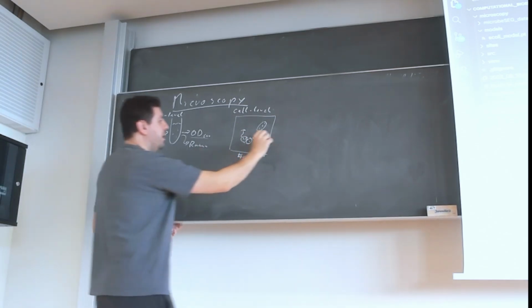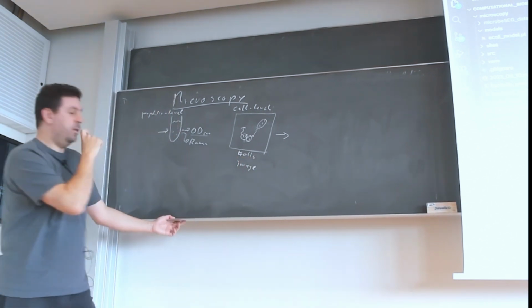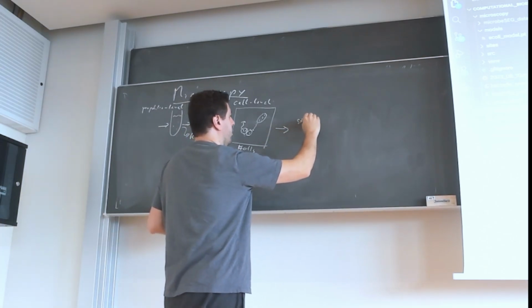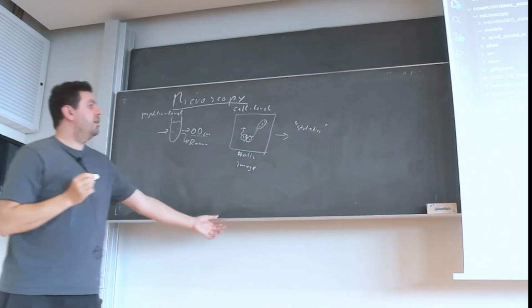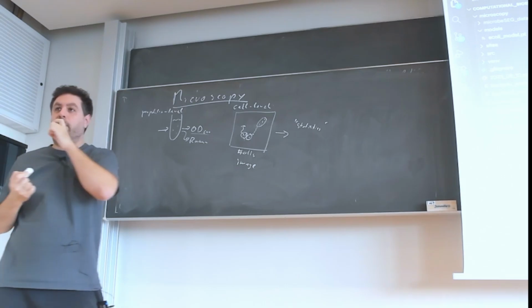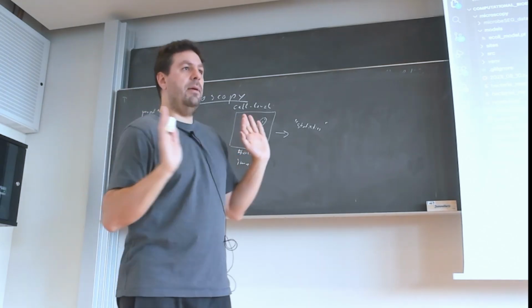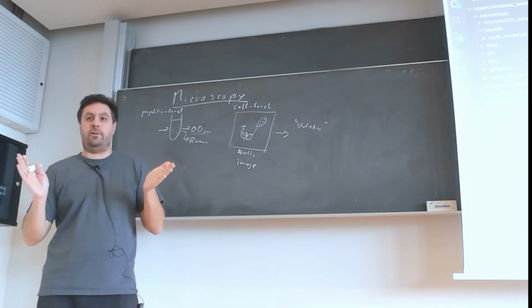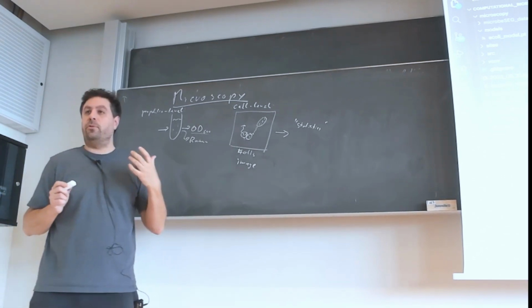And once you have such an image, and we are going to look into what is actually an image in a second, you can create several statistics from this. Statistics, perhaps in quotes, because what we are often interested in is abstract properties from these images. So let's say you have many images from your experiment. These can be images that are not connected, or they can be images from a timeline, from a process that you took. So the sequence has actually a meaning in this case, for example, to track movement. And you want to abstract this. You want to get the essentials from these images.